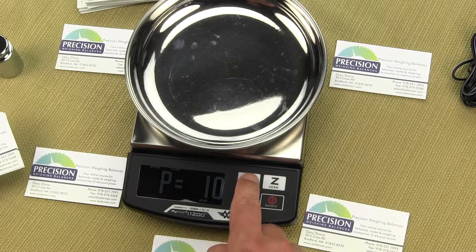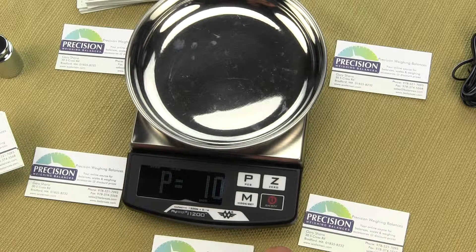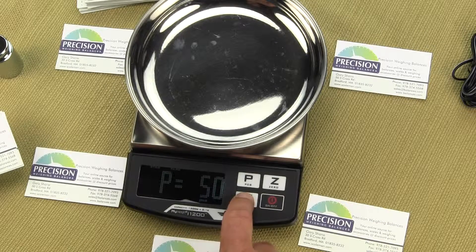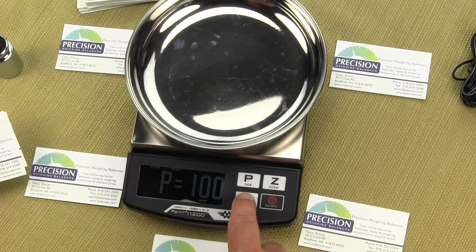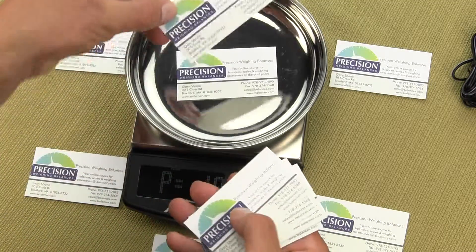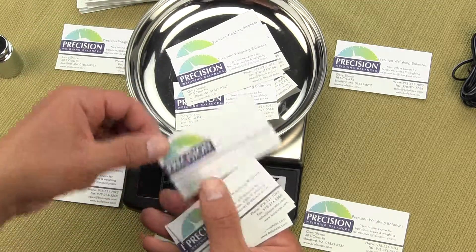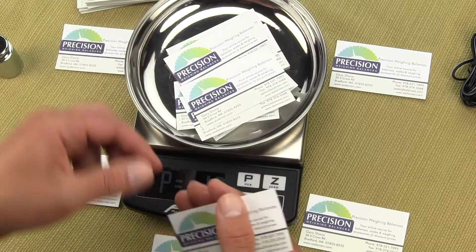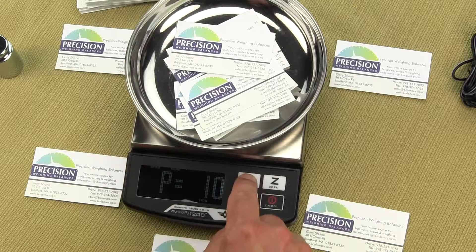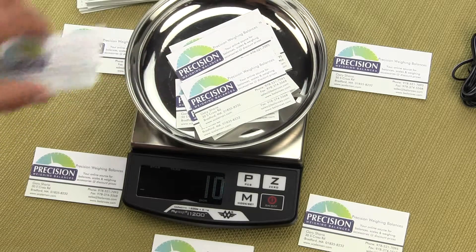Our sample size is 10. You can change the piece count by pressing the M key to 20, 50, or 100, but we want to do 10. So with P equal to 10, I'm going to place 10 business cards on the platform: 1, 2, 3, 4, 5, 6, 7, 8, 9, 10. Once we have our sample of 10, press the P button and it will say PASS — it has now stored that reference value.